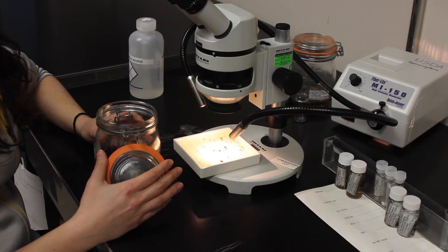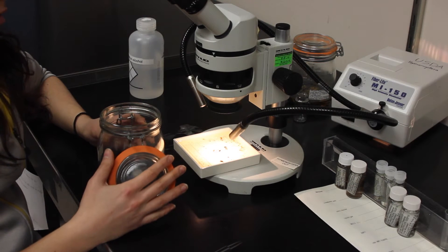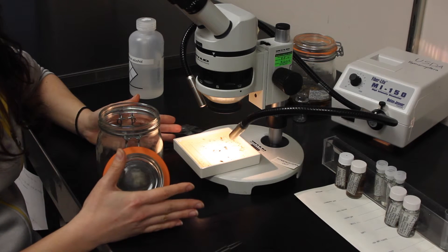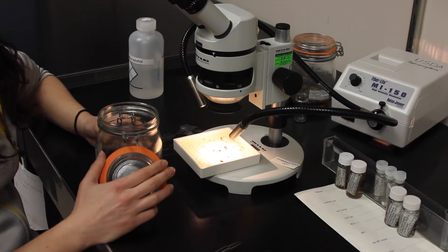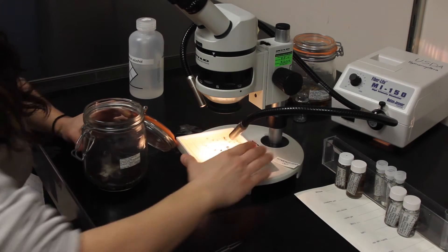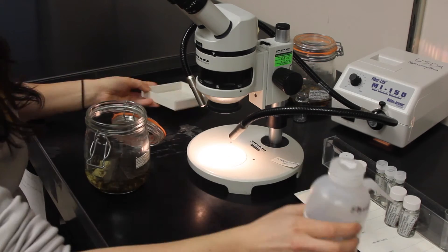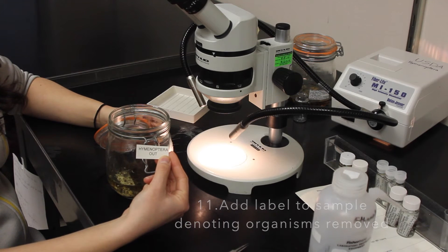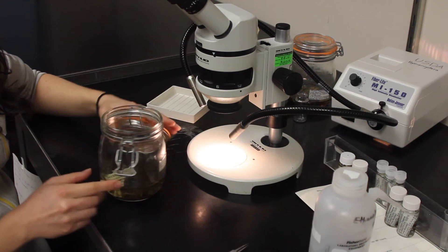I have finished sorting through my sample twice and verified that no target organisms were left. I have also gone through as many times as I have needed to get through the entire sample. Now I need to pour the rest of the sample, now only containing non-target organisms, back into the bale top jar that has the external label. I need to include an additional label that denotes that all target taxa have been removed. I have also inserted the internal label back into this jar.